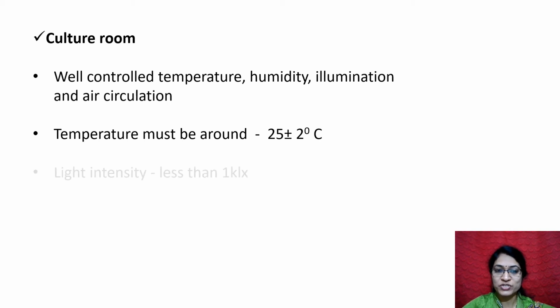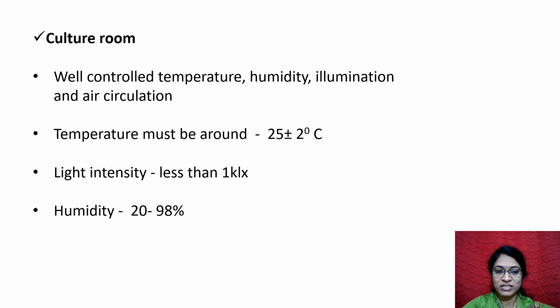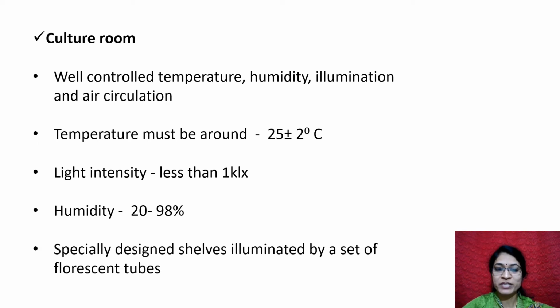The temperature used in this area is 25 degrees centigrade plus or minus 2 degrees centigrade, light intensity less than 1 kilolux, and humidity must be 20 to 98%. Specially designed shelves illuminated by a set of fluorescent tubes must be there in this culture room.